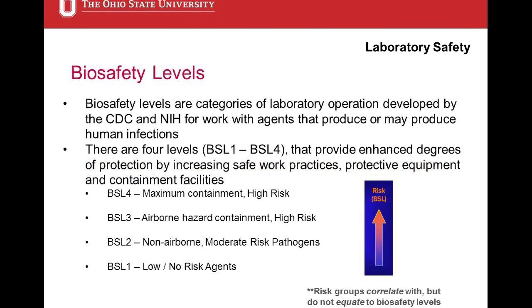So biosafety levels are categories of lab operation that were developed by CDC and NIH for work with these agents that produce or may produce human infections. You'll never guess, but there are 4 levels, 1, 2, 3, and 4, that provide enhanced degrees of protection by increasing safe work practices, protective equipment, and containment facilities. Biosafety level 1 is your lowest containment level. Biosafety level 4 is your highest containment level.